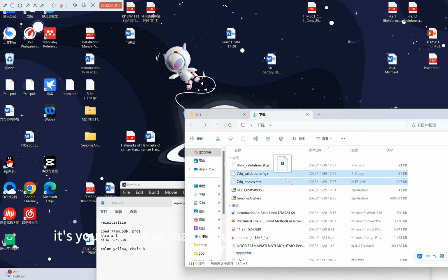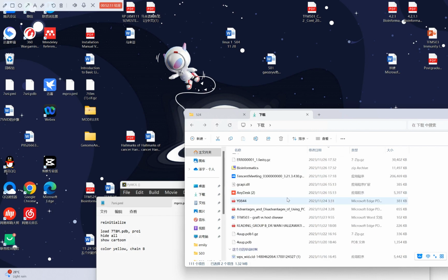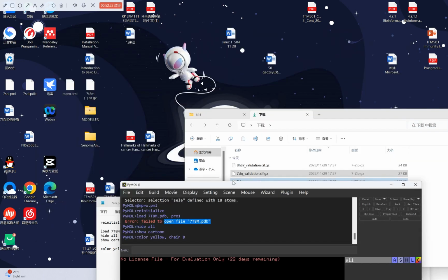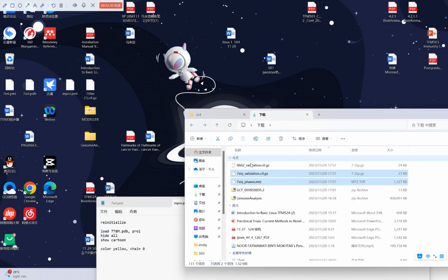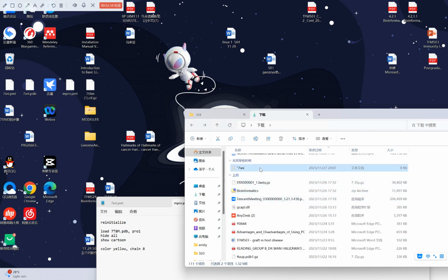You just go back, stay in the same place, you go here, then you type add. The name is, you know, this one. What's the name? Add pro, is it?